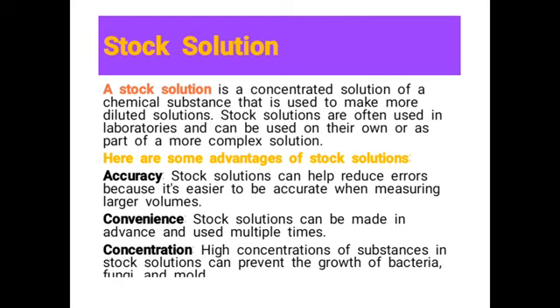A stock solution can be used to make dilute solutions, or it can be used on its own for some laboratory practices or activities, or mixed with other solutions for other purposes.